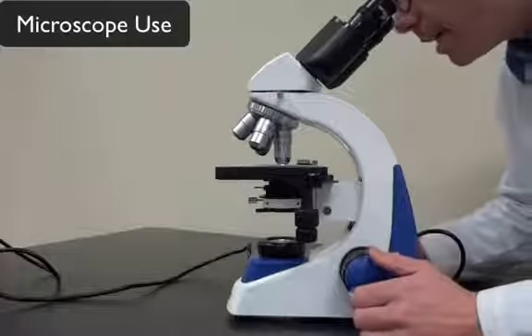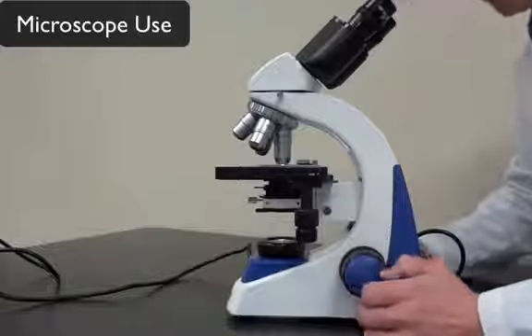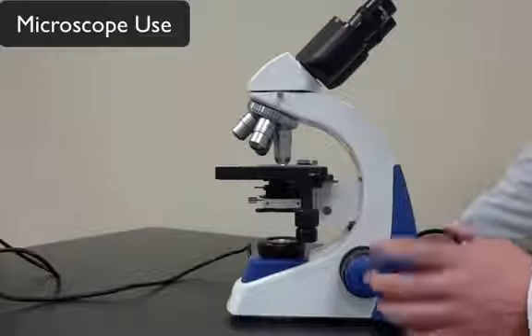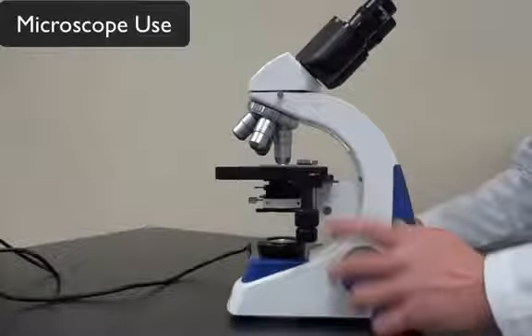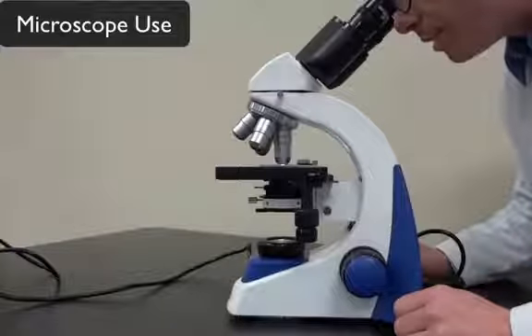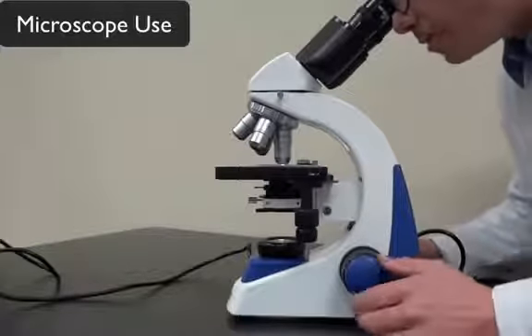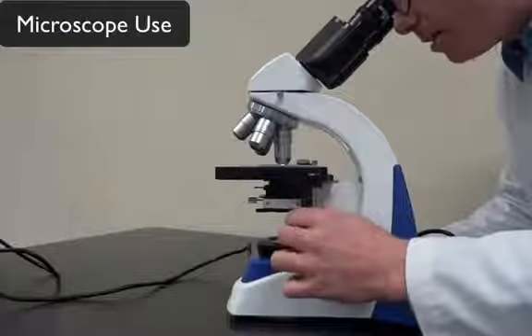And I'm going to look in, and again, it's going to be a little blurry. And usually, in most cases, when you're in the lower power, if you had to use the fine-tune adjustment backwards to get it in focus, that's usually the same direction you have to take it in high power. So now I have it in high power, it's in focus. I can still move the slide around and take a look at things.